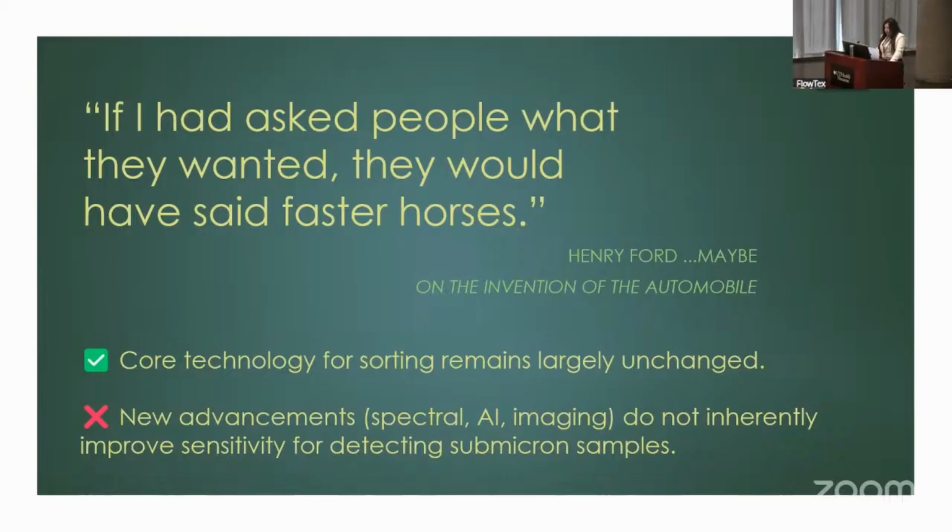So what has changed essentially is that I've been to a lot of courses and a lot of conferences in that time, and everyone in SRLs is just anecdotally saying that the experiments are getting weirder. And it's good weird, right? No offense. But this is coming from me, where almost half my sorts are non-traditional sorts, non-traditional species. Weird doesn't just mean new species. It also means more challenging emerging applications outside of strictly immunology, like synthetic biology, microbiome analysis, and more.